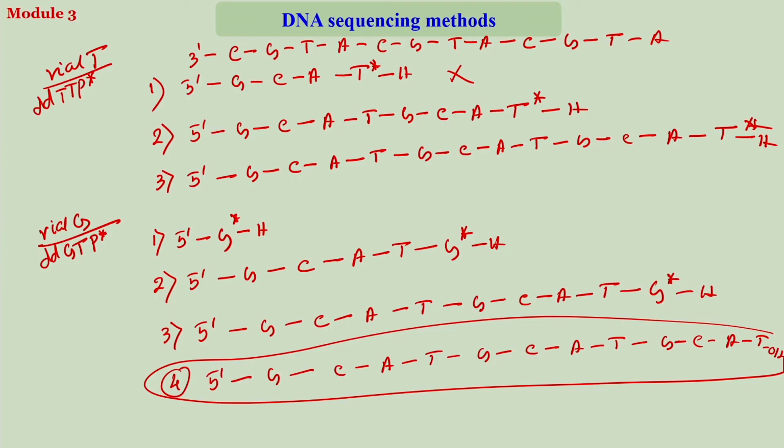Since DNA has negatively charged phosphates, the overall charge of the DNA is negative. So, the number of phosphates means the number of negative charges. As the length of the DNA increases, the negative charge will also increase. And of course, by the charge density, now you can separate the molecules. If we call the fragments individual molecules, all these molecules have different charges, and therefore, we can easily separate them.